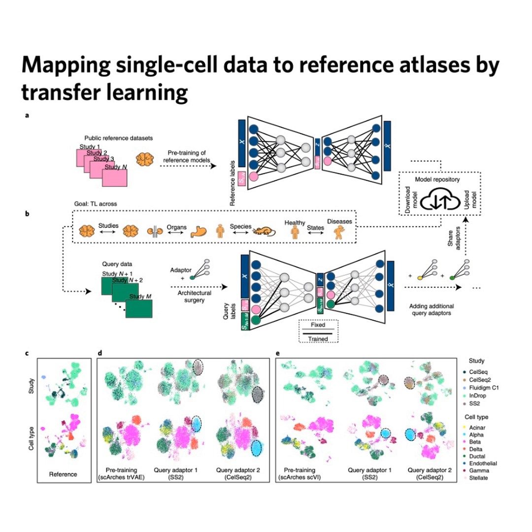The accuracy is there. Okay, let's talk about some of the hard cases, the places where you'd expect a shortcut method to fail. What about really rare cell types? An excellent test, and scArches performed really well. In one pancreas dataset, for instance, it successfully mapped and preserved a tiny population of delta cells. And how rare are we talking? They made up about 0.5% of the entire dataset, so really a needle in a haystack, and the model found it and placed it correctly.